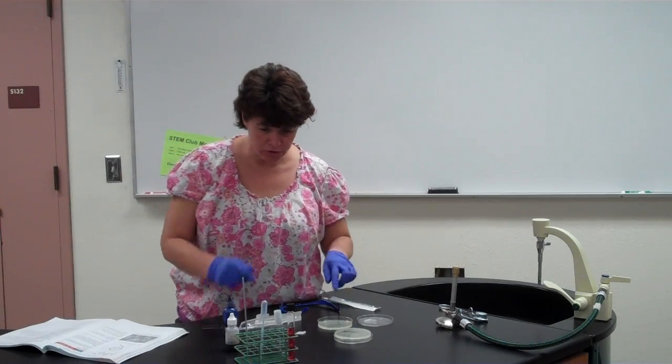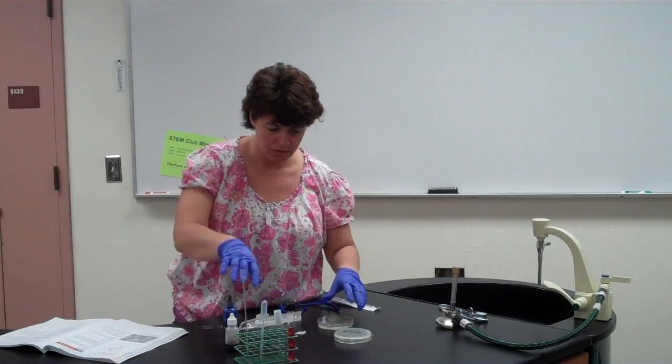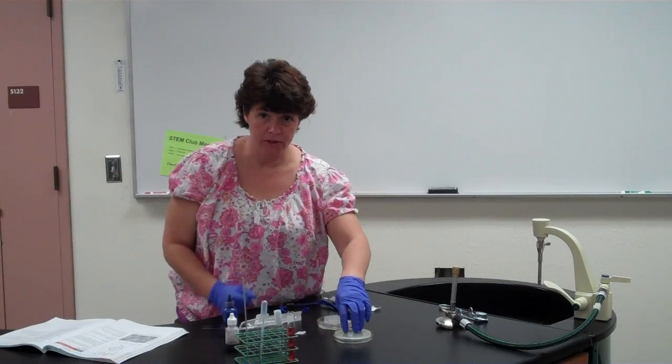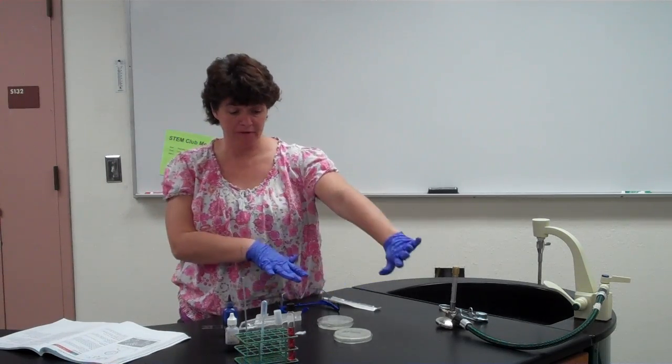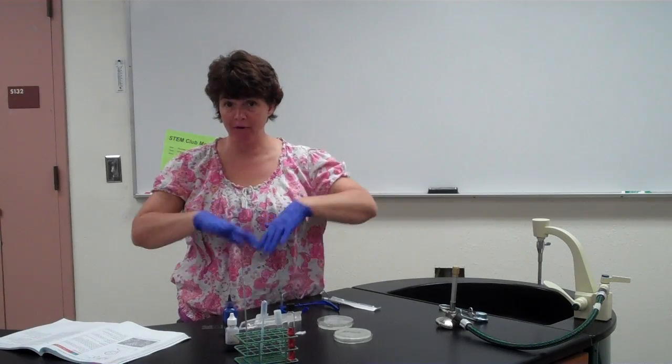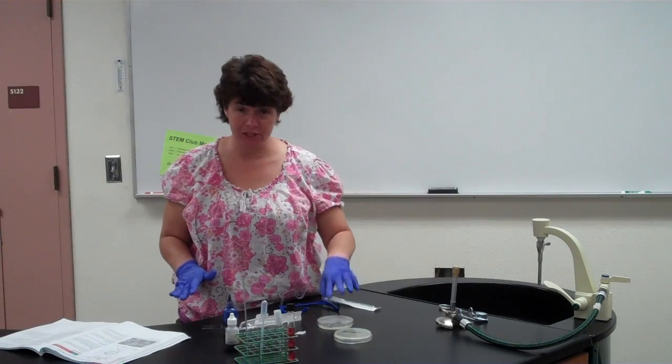And so you'll do that exact technique with the 3 on this plate and the 2 on this plate. Once again, you're just putting a drop on there. You're not spreading it because you don't want them to spread together, and they're going to spread out from that point. So if you'll notice, it says to allow for it to diffuse into the agar. So just let it sit. Put it off to the side. Don't flip it over. Remember how we've been putting things in the incubator upside down? We're not going to do that. We want that to just sit there, and then you're going to put them in the incubator.